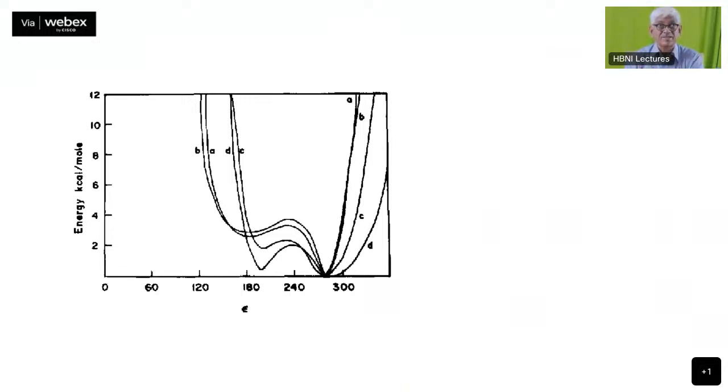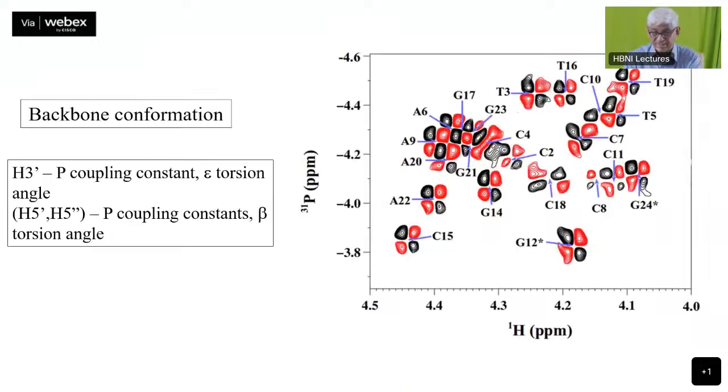These two possibilities exist, and mostly you will see this in B-DNA. This is also seen in the case of the crystal structure, which I showed you earlier, and also in the NMR structures.